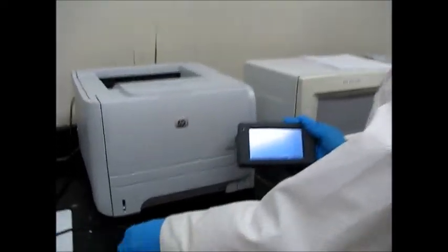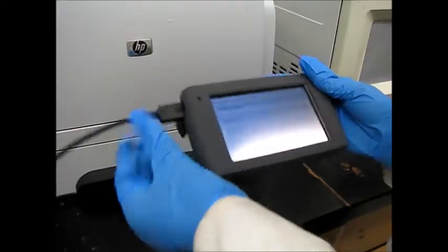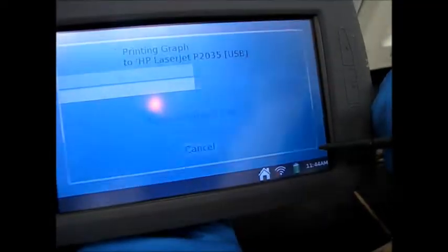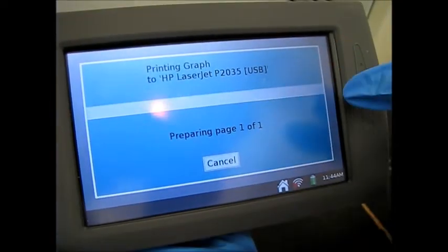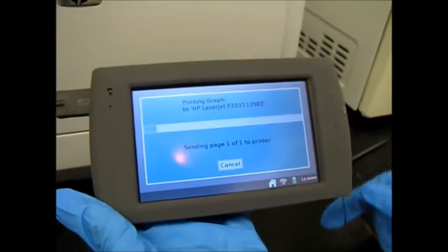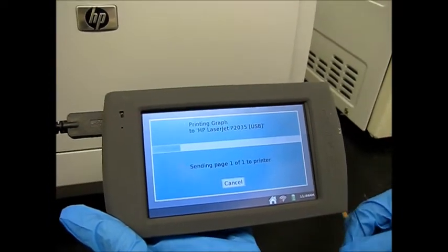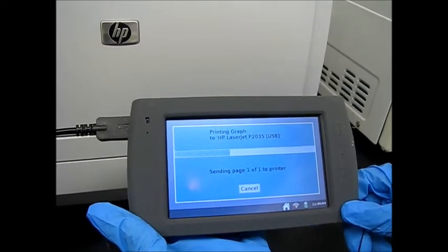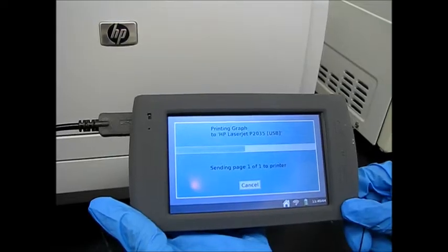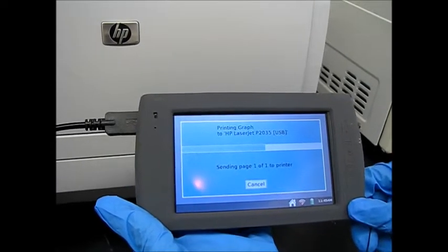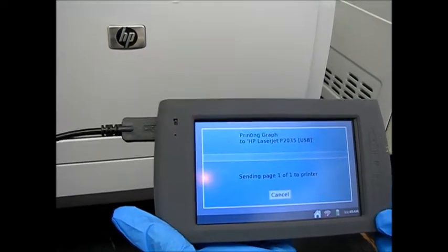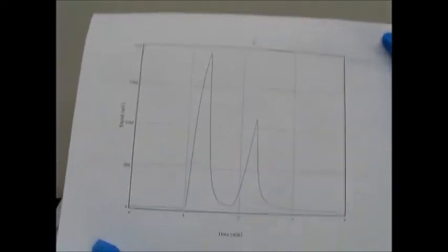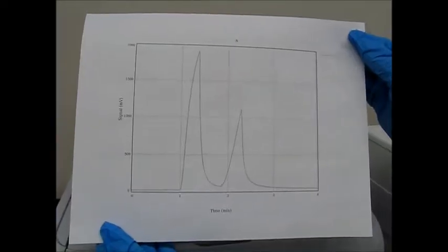Okay, so here we are at the printer. I'm going to grab the USB. And I'm going to insert it into the LabQuest. As you can see, we already labeled our graph title. And next I'm going to press print. And now you have to be patient and wait. And the bar will fully load with blue. As you can see, it's starting on this side. When it fills all the way up, then your paper should print. And here we are. Great. This is the fraction A. Now we have to do fraction B and C.